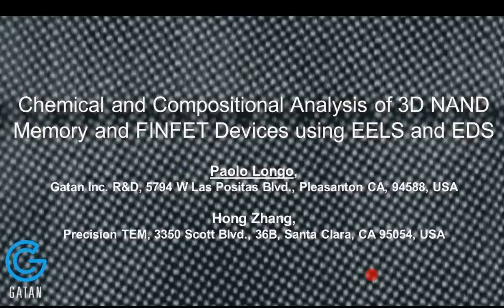That's a good question. All the data were taken at 200 kV. Lowering the voltage would definitely help, because we would actually have bigger cross sections. We'd get more signal for both EELS and EDS. But at that point, thickness becomes more important, so you want to make sure that your sample is even thinner if you want to work at a lower voltage. This is something you want to take into account. But as long as you keep the dose lower, you should be able to get accurate data. Make sure that you don't damage the sample.